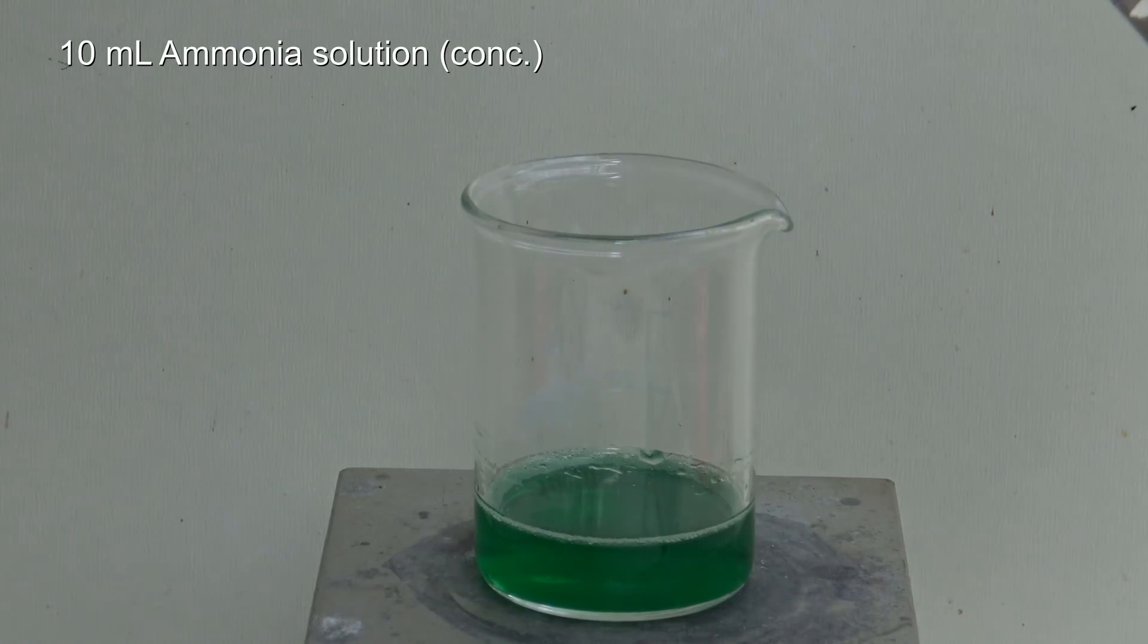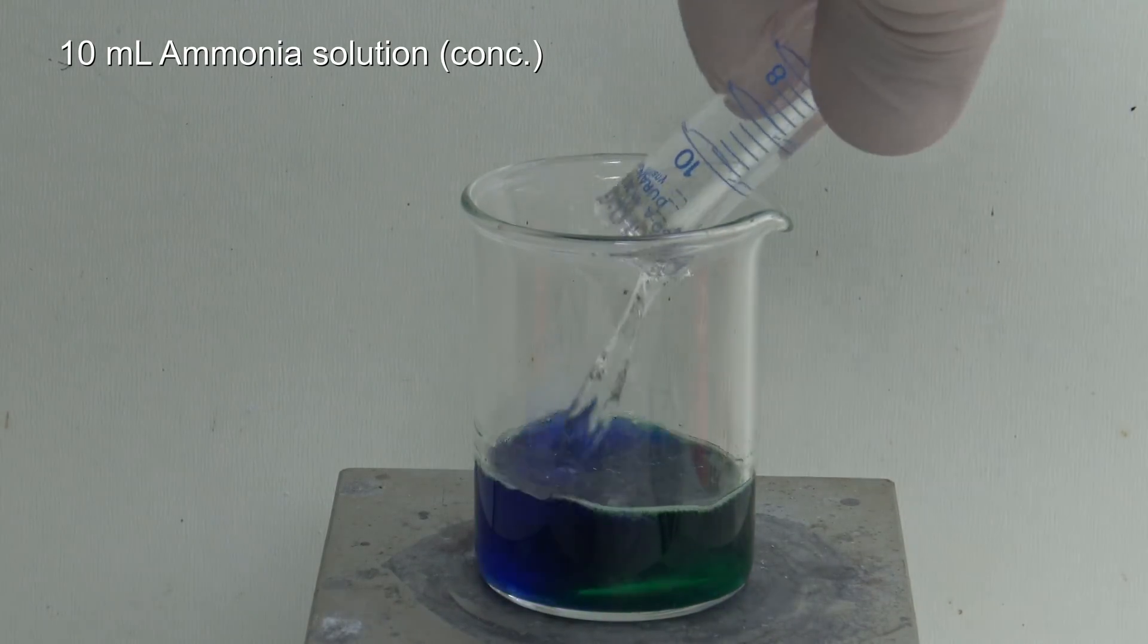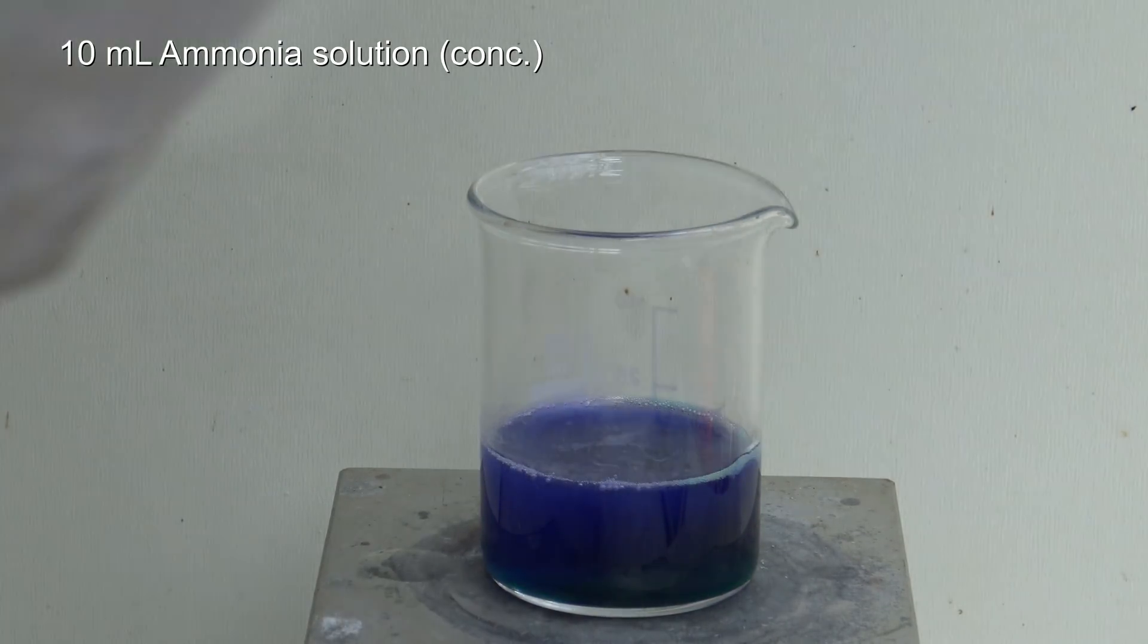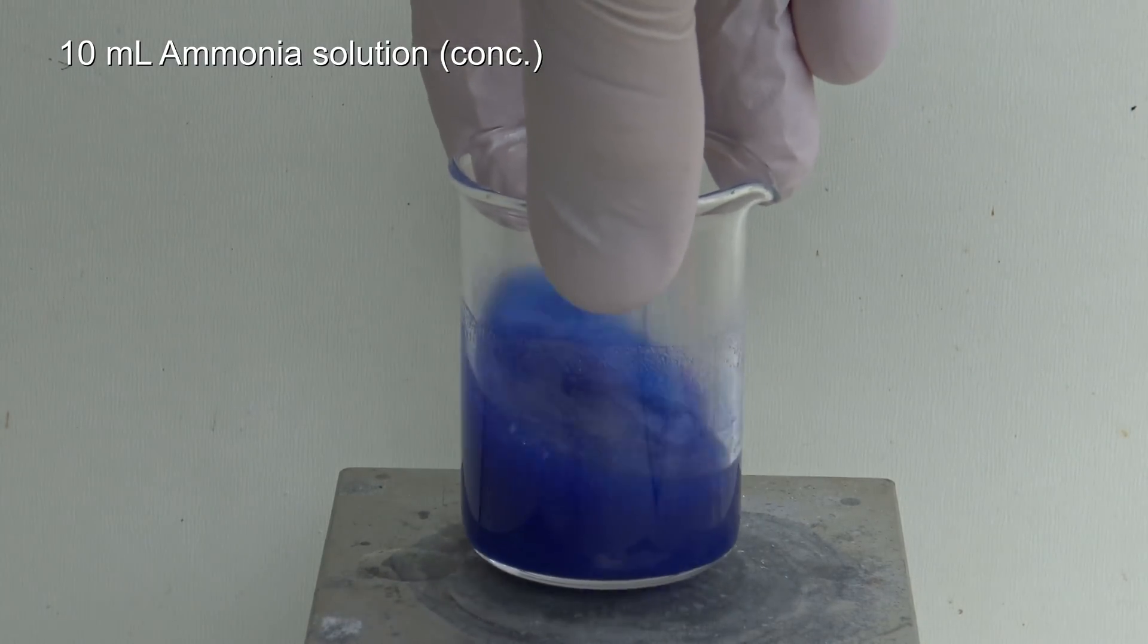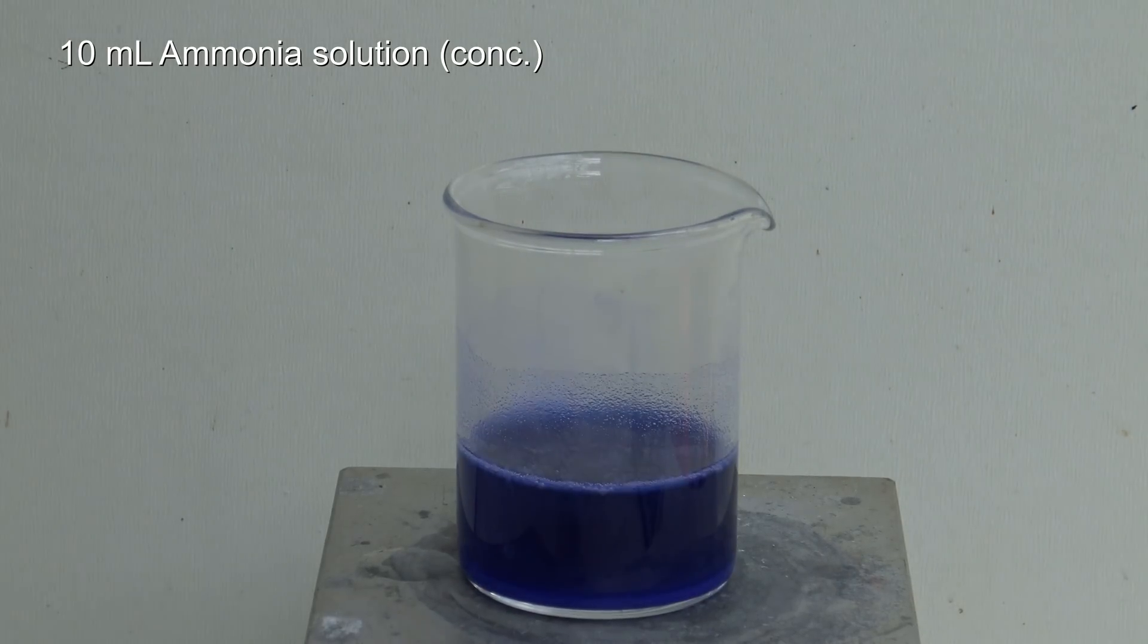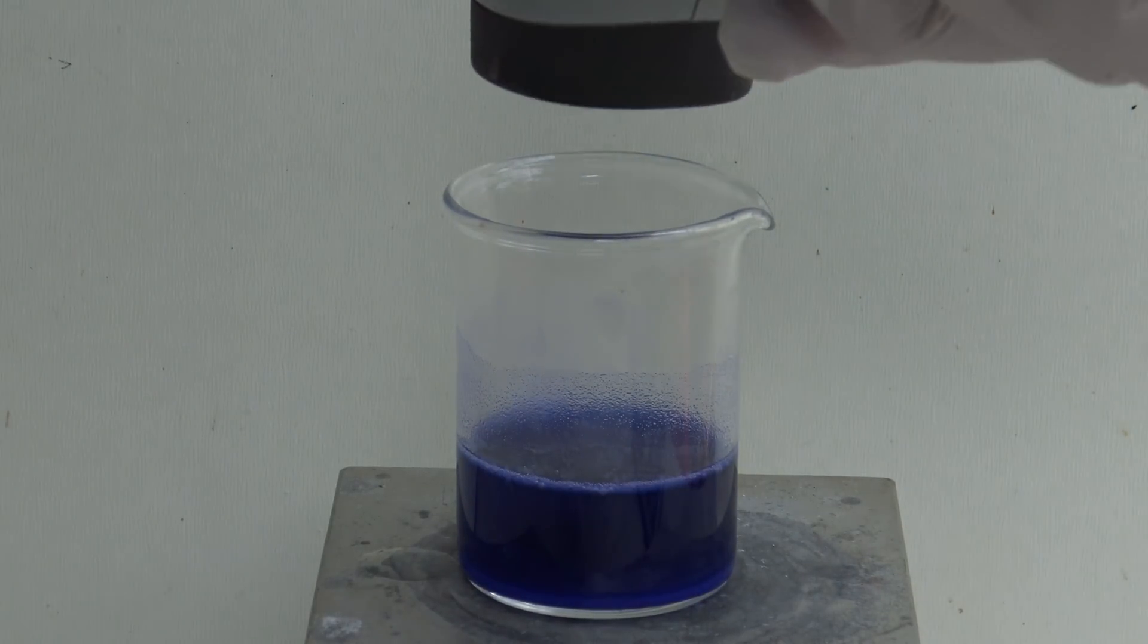Then, 10 milliliters of concentrated ammonia solution were added. The solution turned blue and a precipitate formed immediately. In addition to that, the solution heated up a bit.